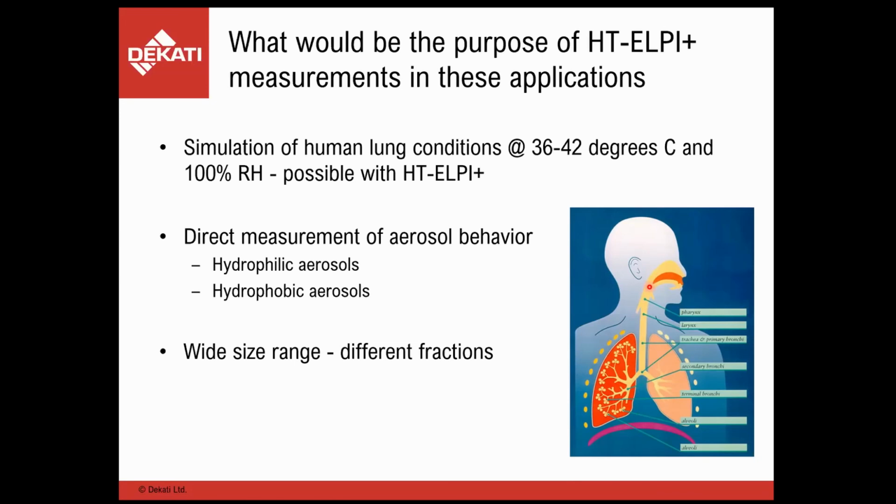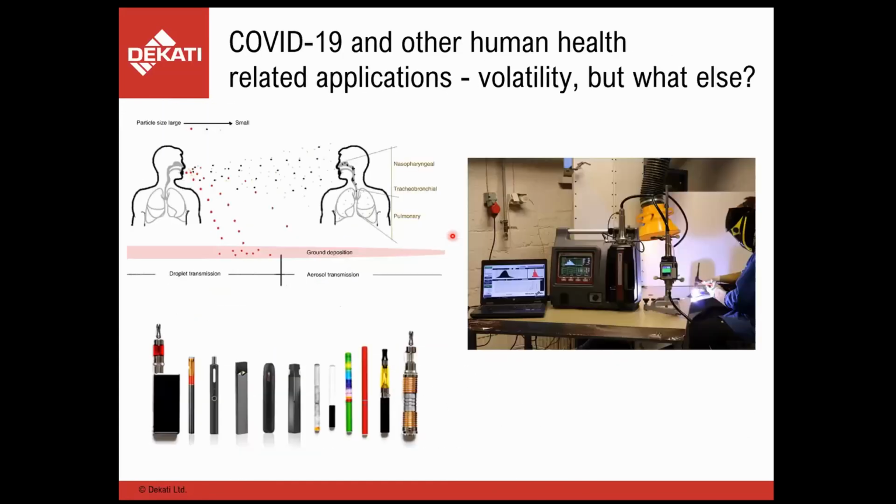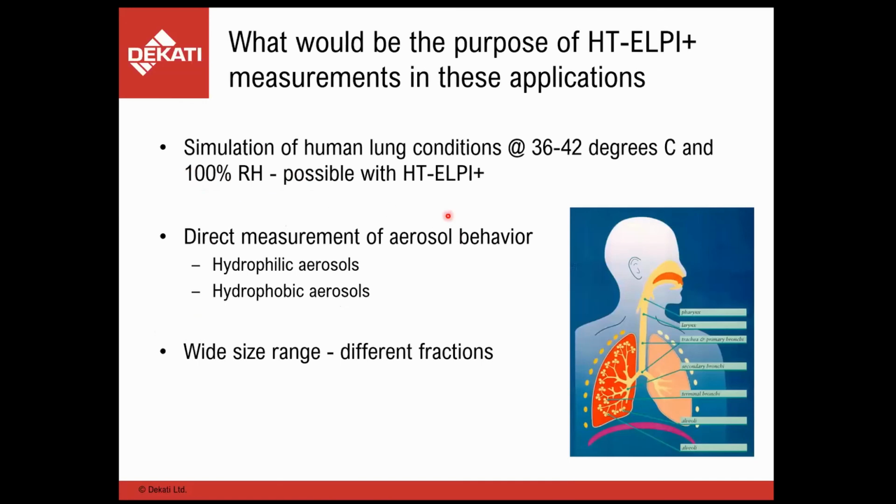Coming back to setting the 100% relative humidity, it can actually be done with this, what we use here for drying the aerosol. The Nafion material can also be used to humidify an aerosol by providing air at a specific humidity into the Nafion system. We can actually adjust the humidity of the sample itself. So that would be one example of how to adjust the relative humidity of the sample.